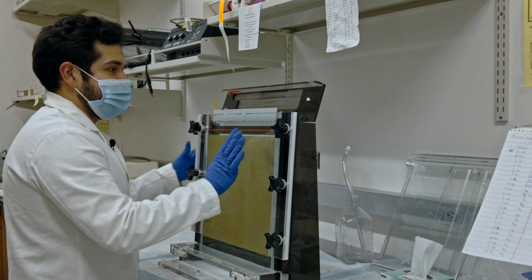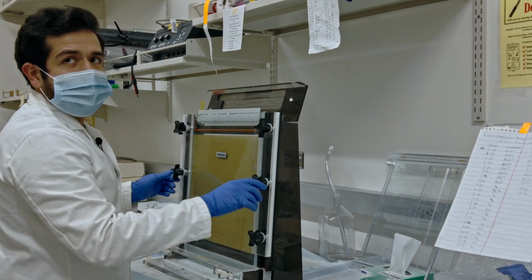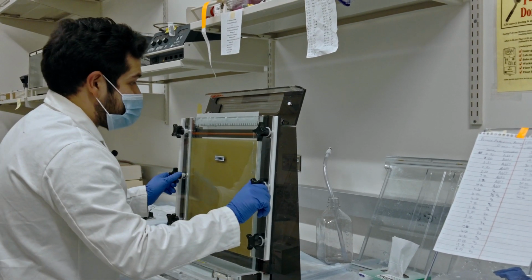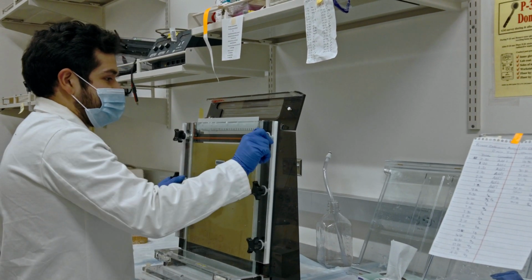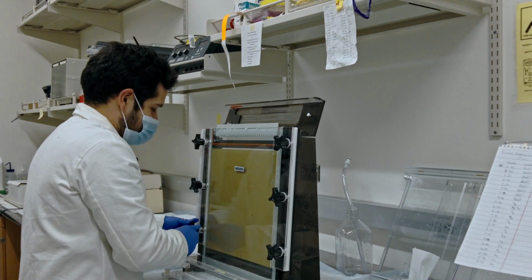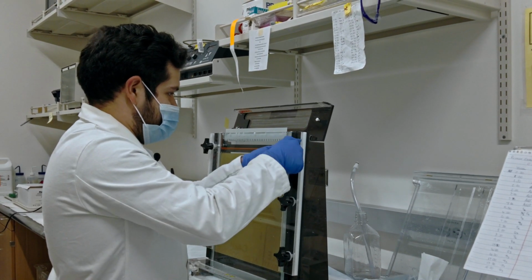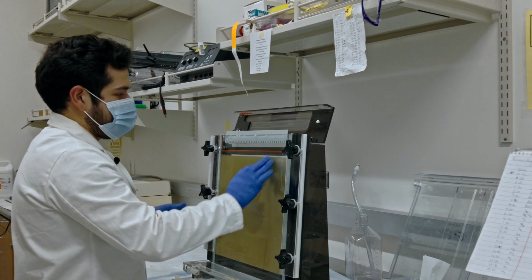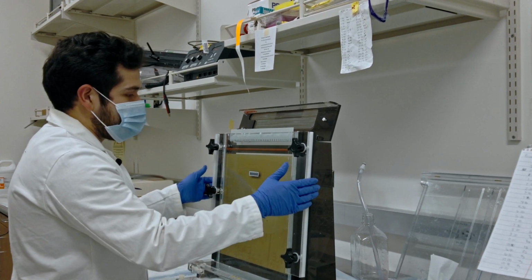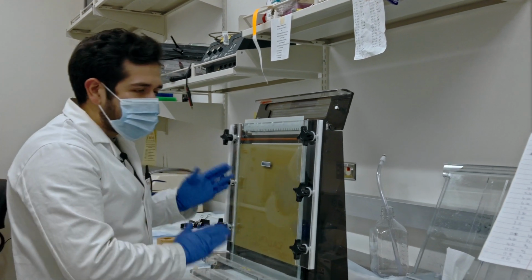Now, if you're curious if you have tightened it enough, what I use to make sure is whenever you actually put in the running buffer. The way this system works is that if you have made this gel tight enough in the gel box, whenever you introduce your running buffer in the top compartment, there shouldn't be any leakages in the back side of the gel. If you do see some leakages, this means you might have to tighten the top portions, the middle portions, and the bottom portions a little bit more again in order to get a nice tight seal.